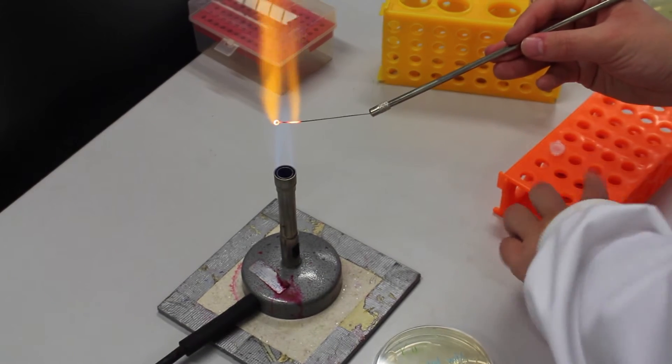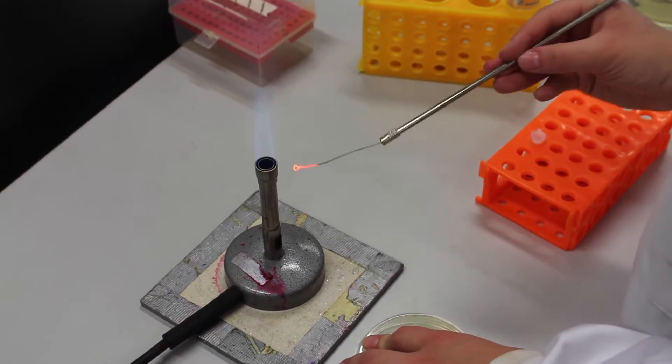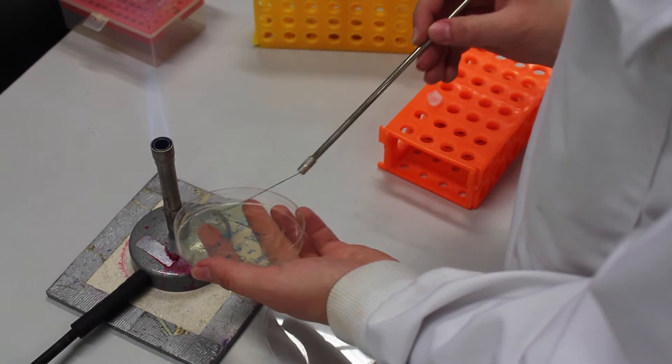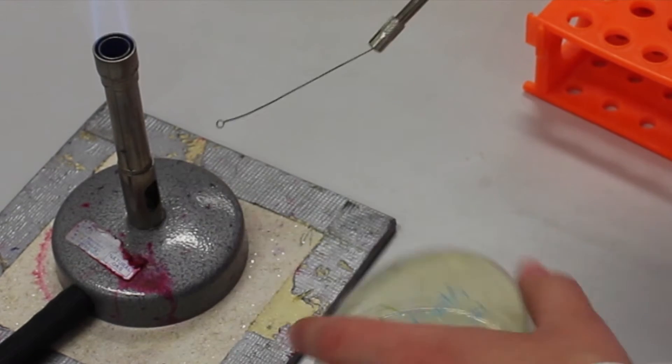The inoculation loop is sterilized by passing it through the hottest part of the flame. The inoculation loop is cooled on a separate part of agar that doesn't contain colonies before being used to scoop up a colony.